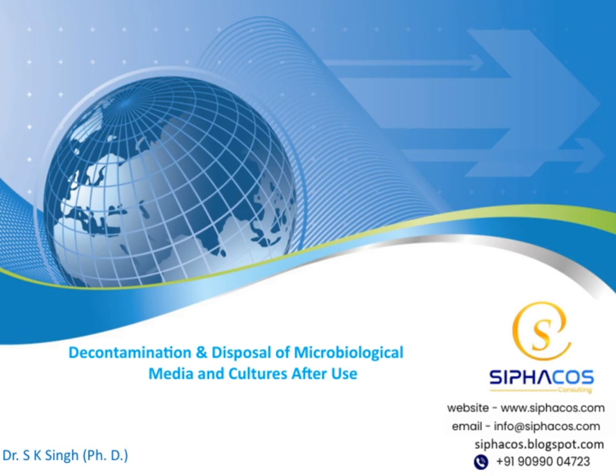Today, we will be discussing an important aspect of microbiological safety, decontamination and disposal of microbiological media and cultures after use. My name is Dr. S.K. Singh, and I hold a PhD in this field. Over the course of this presentation, we'll explore the best practices for safely handling and disposing of used media and cultures, ensuring safety and compliance. Let's get started.